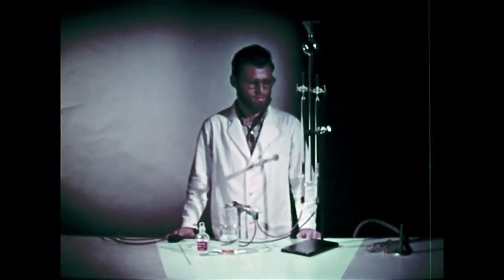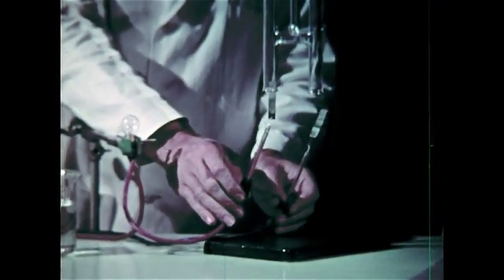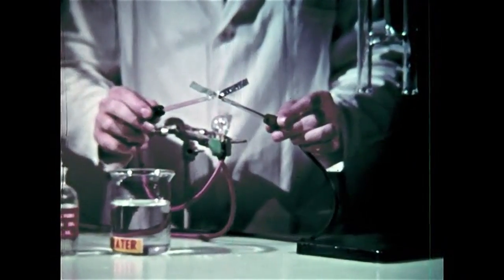The separation of oxygen through electrolysis of water is also a common industrial method. Two electrodes are used to pass an electric current as shown by the light.